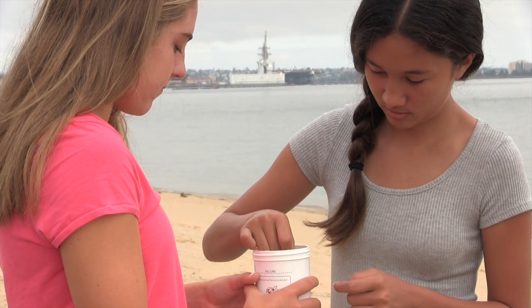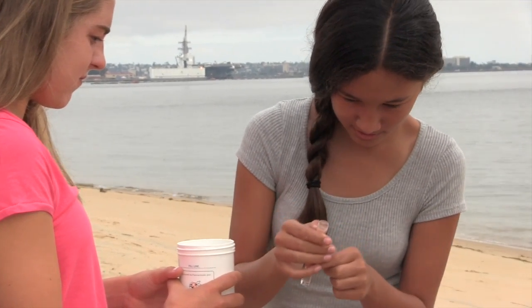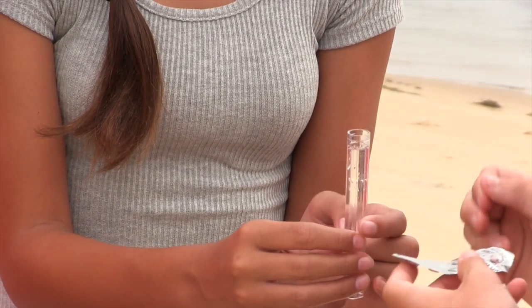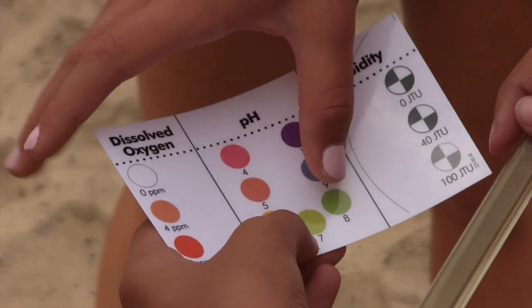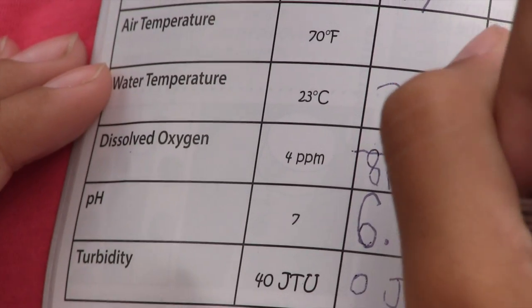Fill the test tube to the 10 milliliter line with the water sample. Add 1 pH wide range test tab. Once the tab is disintegrated, compare the color of the sample to the pH color chart.